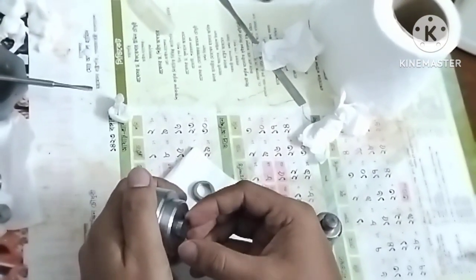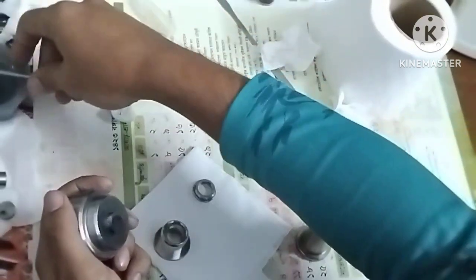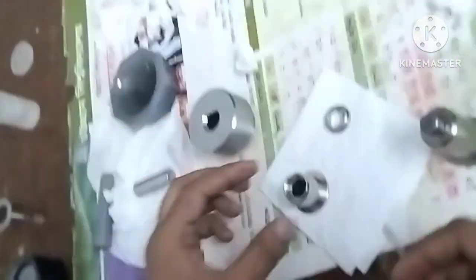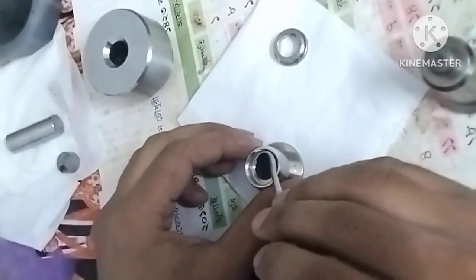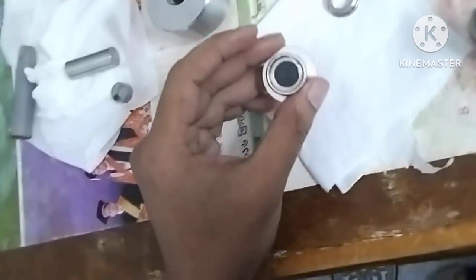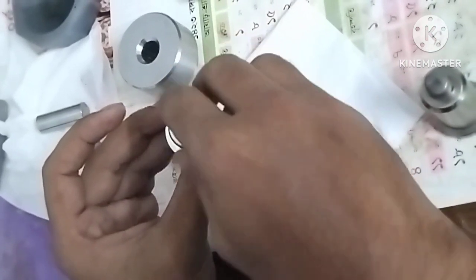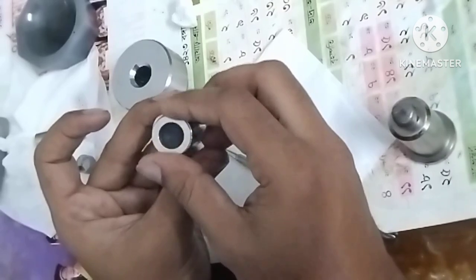We can use a hand if it is clean, but it is not suggested, and we will press properly in the center portion of this FTIR cell, and we are using the spatula to transfer or properly place it. After properly placing our KBr plate, we will set up the steel ring.